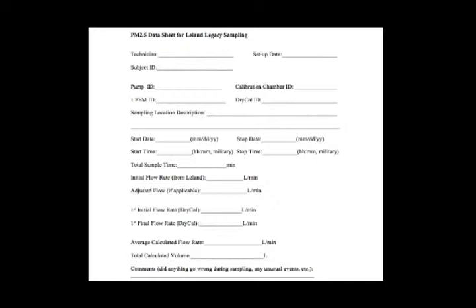Eventually, if you're using a Teflon filter, you'll have the mass collected of particulate. This can then be put into micrograms per cubic meter. Note that you cannot use Leland Legacy software to download data, only to program the instrument.